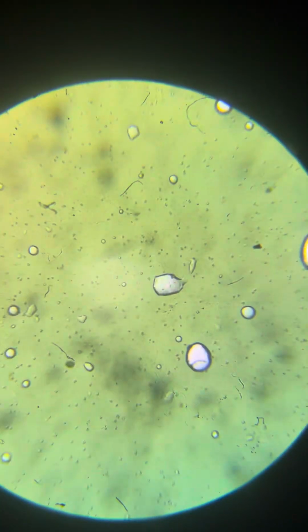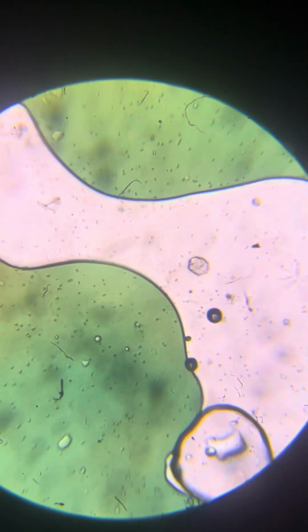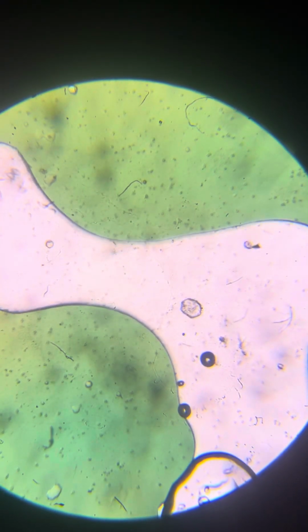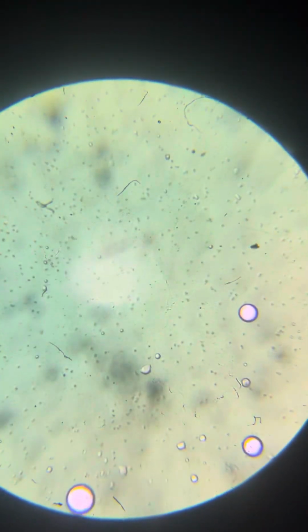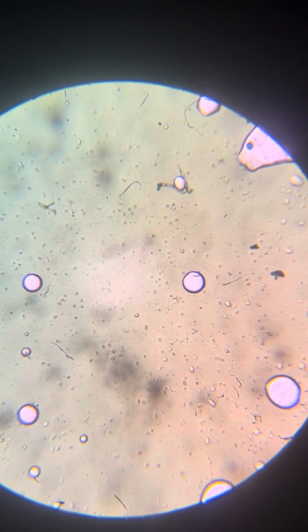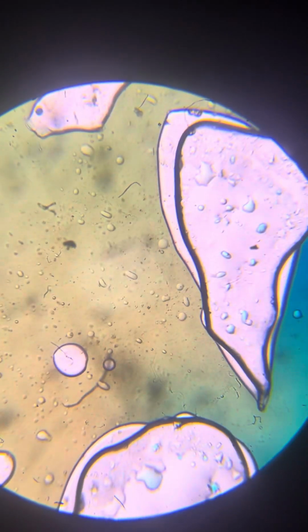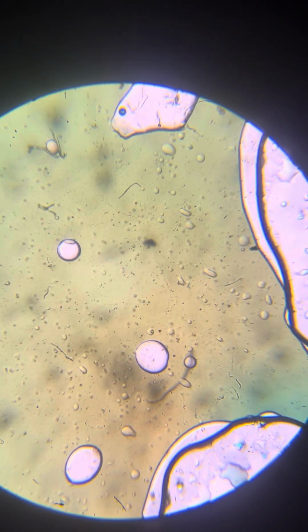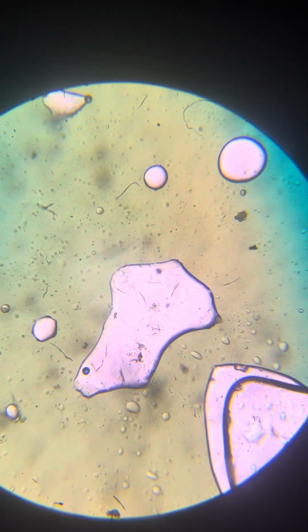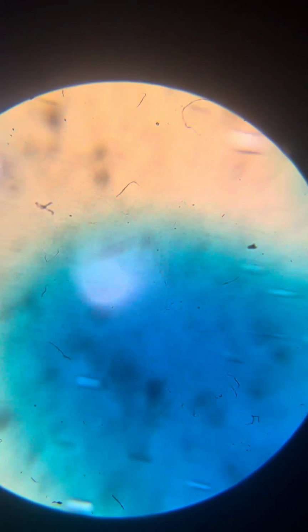We do see Neos, but we don't see that many trains. The question is why, because we've seen much more yesterday. Maybe we just aren't lucky. I mean, it's not that there are no Neos here. We can see the Neos walking on some worm-like objects, but not really on a train.